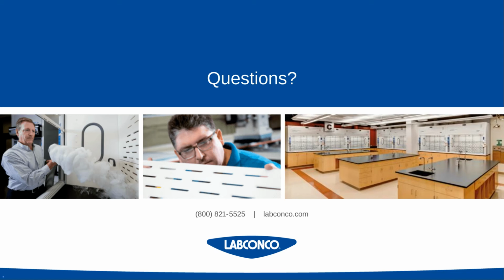So when I say a conventional hood, it's more as it relates to the performance of a hood. A high-performance hood has been proven to have exceptional containment properties, which allows it to be operated at lower face velocities. Conventional fume hoods, before the implementation of these high-performance features, were typically only able to run at higher face velocities, like 100 feet per minute, which was for a long time the standard of safety with fume hood operation. So when I say conventional fume hood, I mean a fume hood that has not had those high-performance features added to it and is operating at 100 feet per minute, because it hasn't been proven to contain well enough at lower face velocities to be acceptable in that manner.